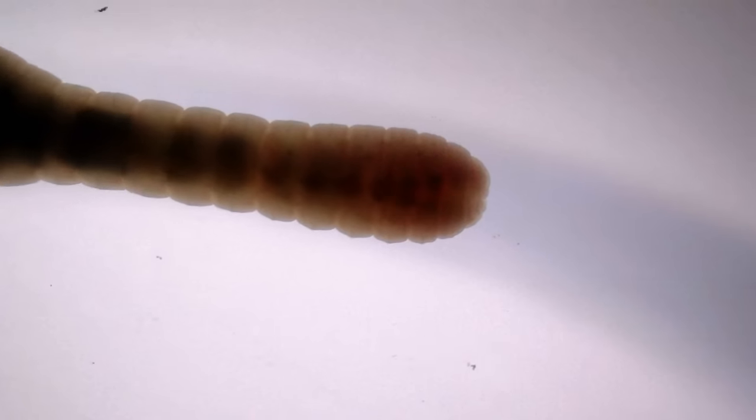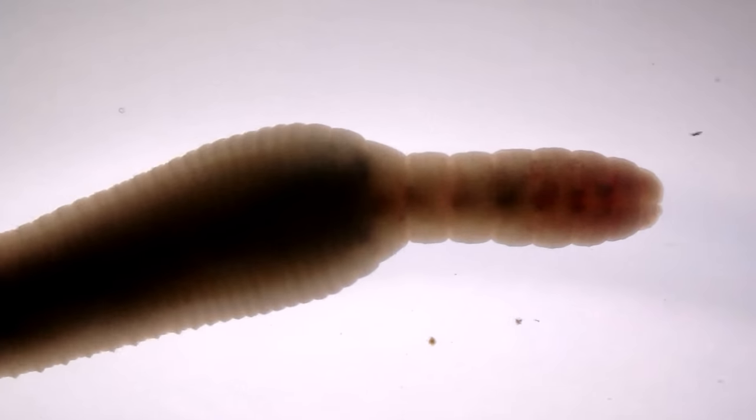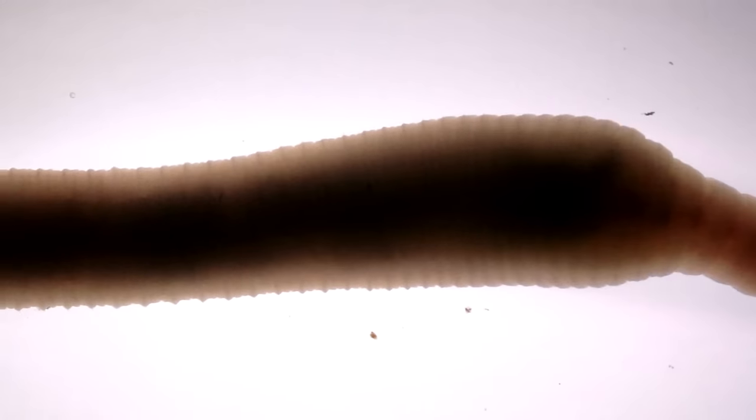And here you see the back end where the waste comes out of course. And here you see the movement of the worm, how it pulls itself together and then pushes itself forward again.